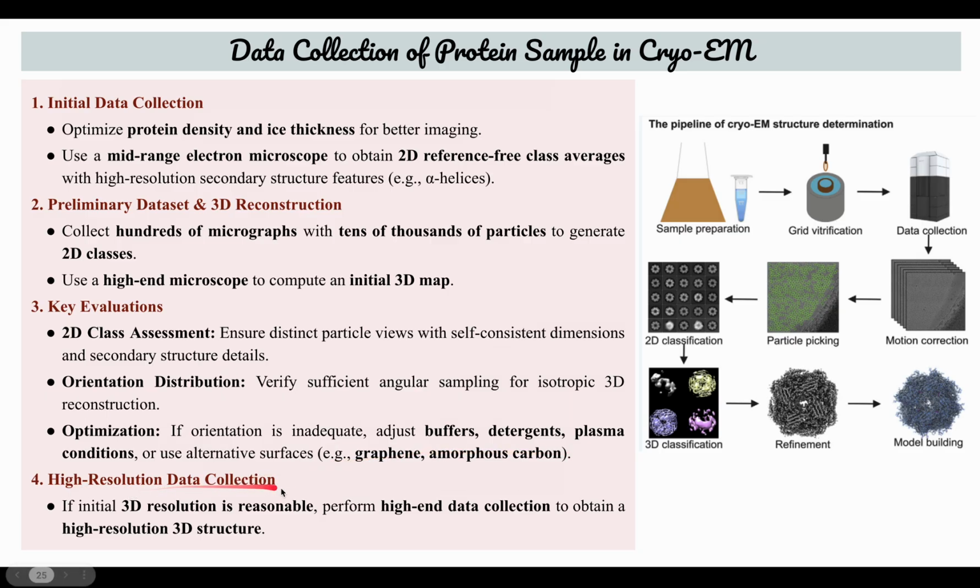Then comes high resolution data collection. So if the initial 3D resolution is reasonable, then we perform the high-end data collection to obtain a high resolution 3D structure.